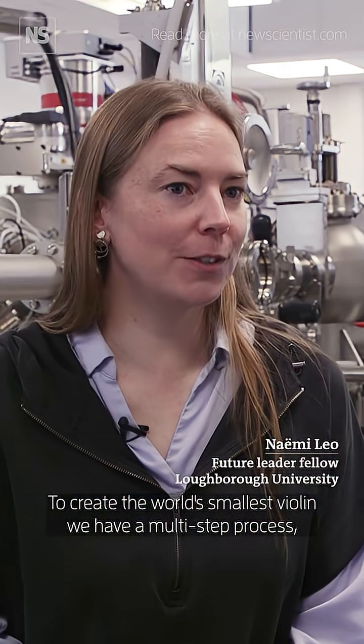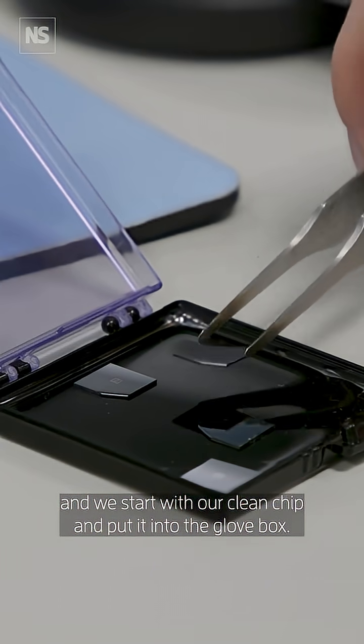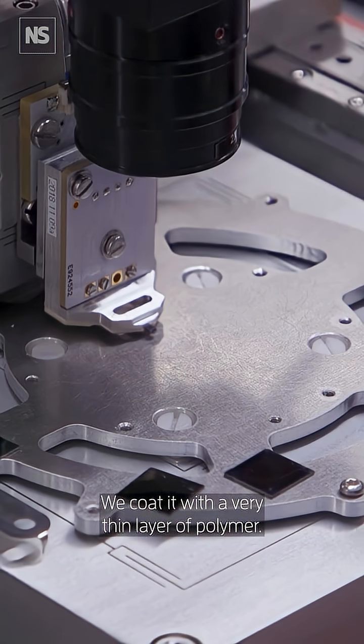To create the world's smallest violin we have a multi-step process and we start with our clean chip and put it into the glove box where we coat it with a very thin layer of polymer.